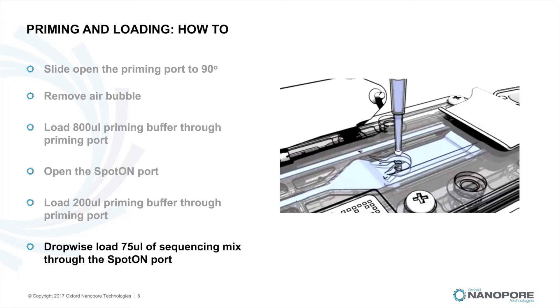Mix the prepared library gently by pipetting up and down just prior to loading. Add your sample or library to the flow cell via the spot-on sample port in a drop-wise fashion, ensuring each drop flows into the port before adding the next one. Gently replace the spot-on sample port cover, making sure the bung enters the spot-on port.